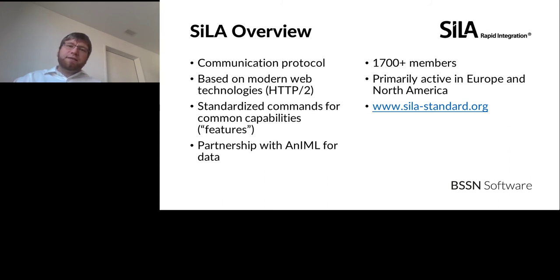And this will not break compatibility with other applications, which is quite interesting. And so these features grow over time, and it's an open process. Anyone can contribute to features like that. If you think there should be a communication protocol for talking to instrument X, you can join the effort and actually help build it.